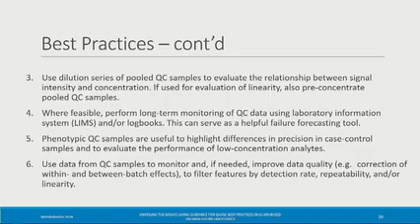But yes, changing injection volume is an easy way to do it if you can span a large enough range with your volumes, right? Then that will work as well. So yeah, excellent point. Good. One last comment for best practices. I think I see a hand over there.